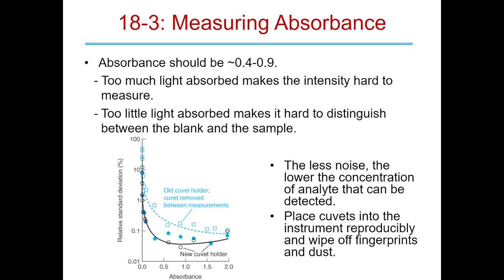If you have less noise in your spectra, like our visible light spectrometers that we used, you can go down more. And so we went down to like a 0.1, right? And you notice that it didn't have any noise at all, did it? It wasn't bouncing up and down, it wasn't moving around. When you went back to it, you got the same number every time, didn't you?